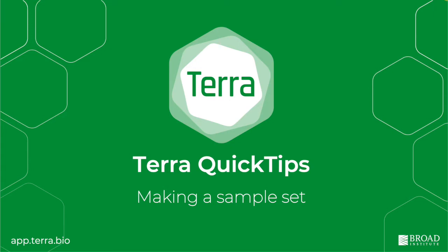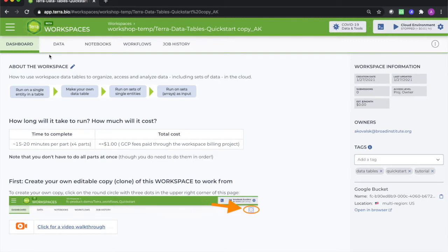In this video, you'll see how to create a set of specimens or samples by running a workflow using the data of your choosing as an input to create a set of those inputs in the form of a set entity. Start by going to one of your workspaces that contains individual samples you would like to organize into a set.